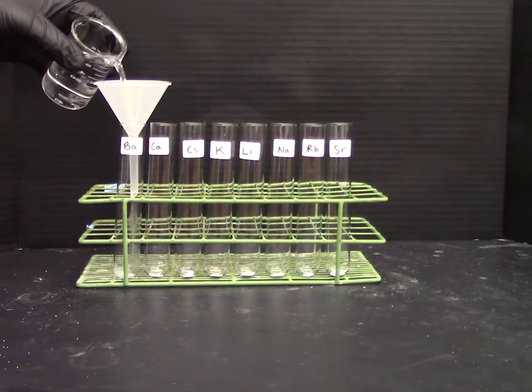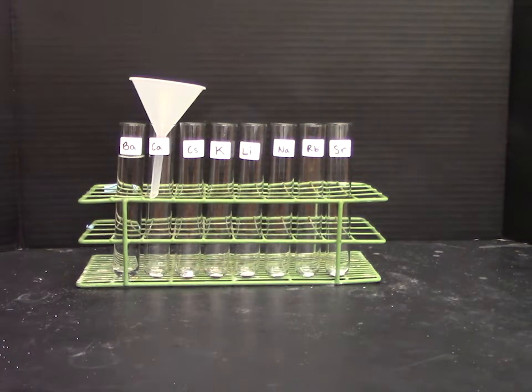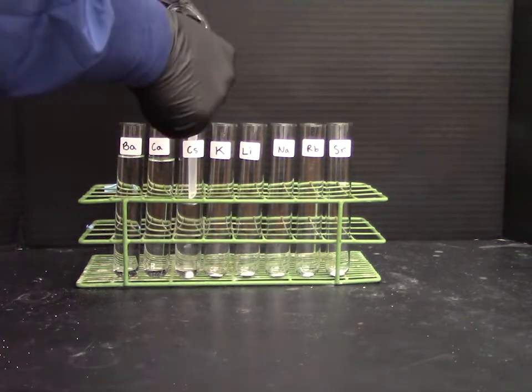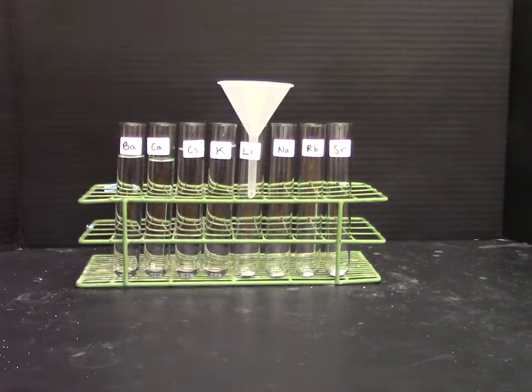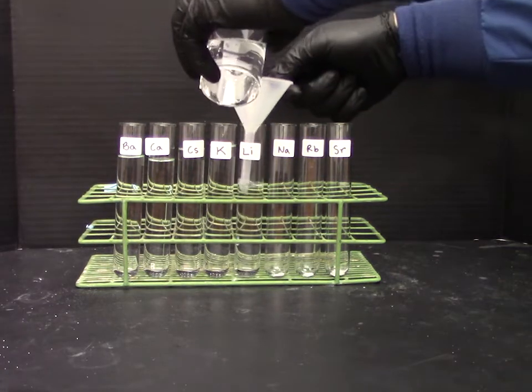Once we've dispensed each of the analytes into its own test tube, we'll add water. Notice again we're not adding a specific amount of water, we're just filling these test tubes up until the water level is near the top of the test tube. We're using chloride salts of each of the metals, and all of these salts are fairly soluble, so you likely won't need to stir the solutions.